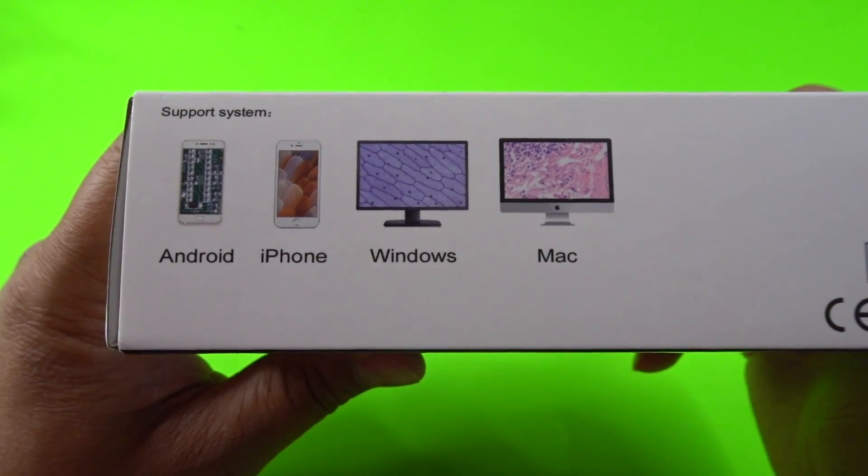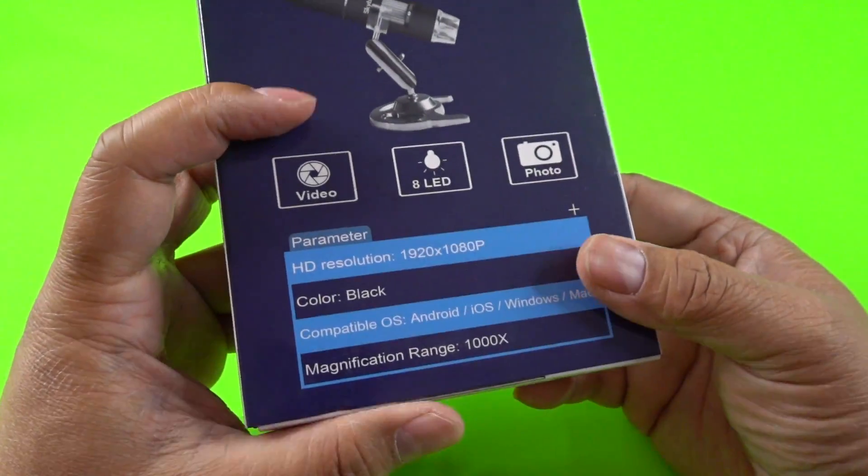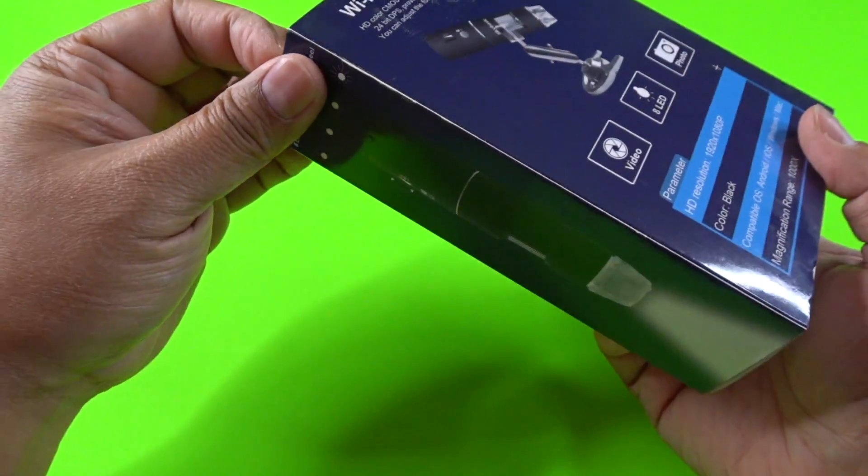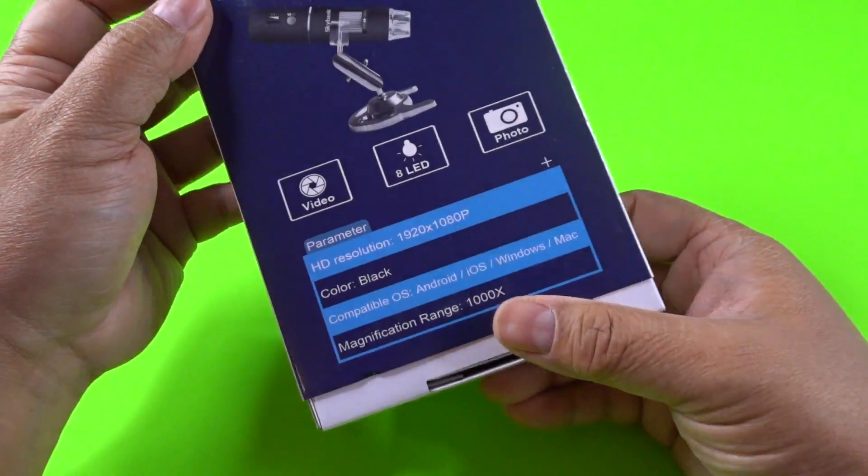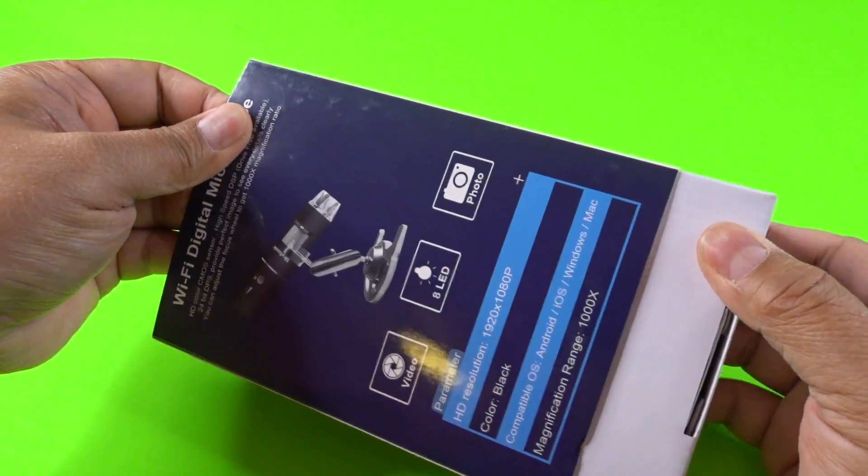You can see it supports Android phones, iPhones, Windows, and Mac computers. I picked this up on Amazon for $41.99 at the time of this filming and there is a coupon for 25% off. This does have four stars and over 440 customer reviews so it's got to be awesome. Let me go ahead and open this up and let's take a look.